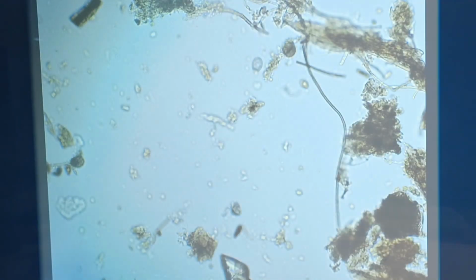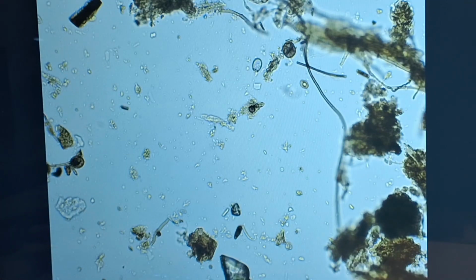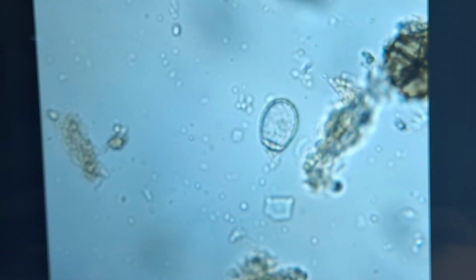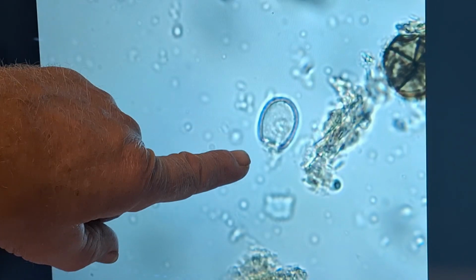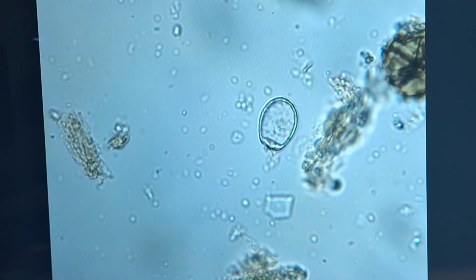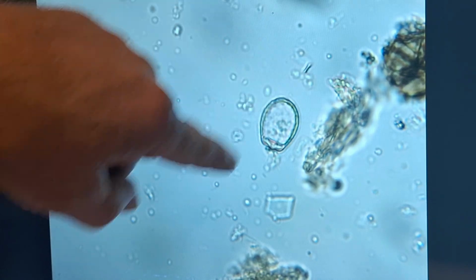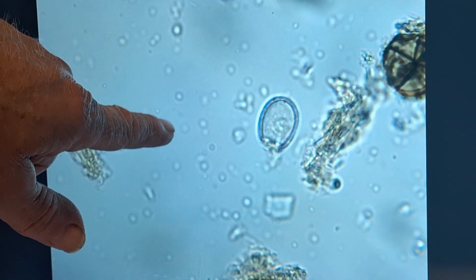Again, we'll go back out to 100. Another strand of fungal hyphae. And next to it, I believe I see 2 protozoa, 2 shelled amoeba. We'll zoom in and have a look at those. There's a real good look at one there. We're in at 400x now. We can see the mouth on that end. Good look at the shell. Some of the insides as we zoom in and out. Real good look at bacteria around here too. All different shapes and sizes as we go through the layers. Nice rod bacteria there. So the bacilli and the cocci being the round ones.